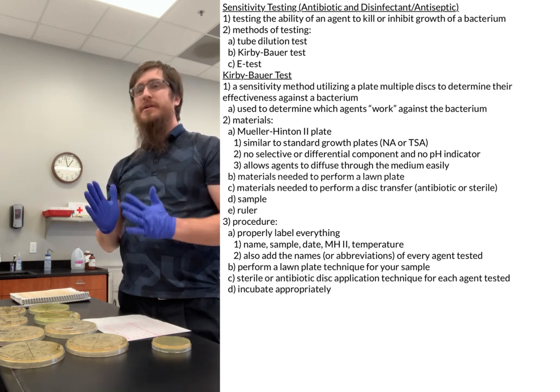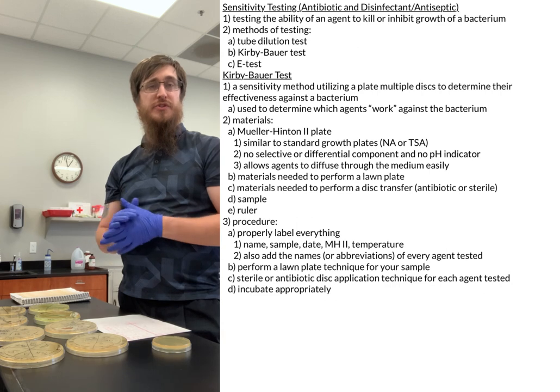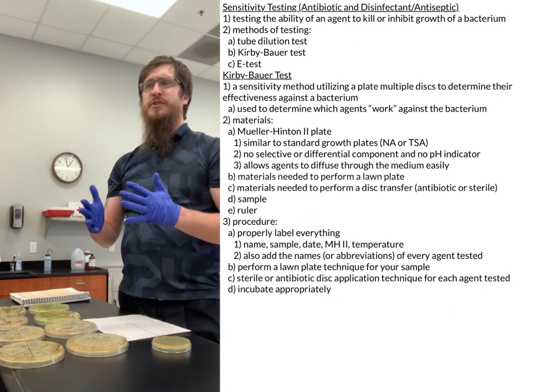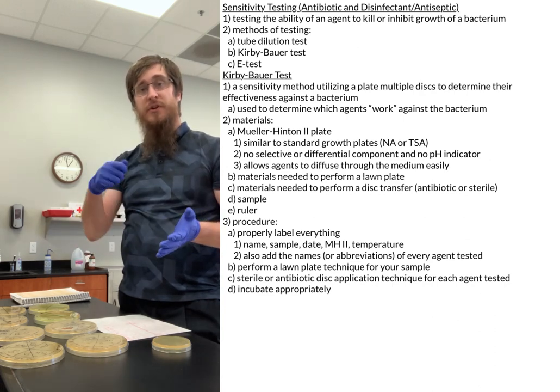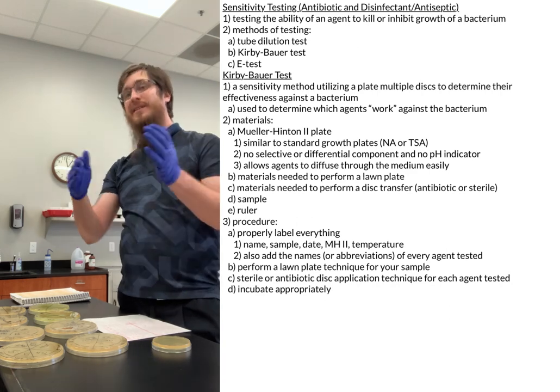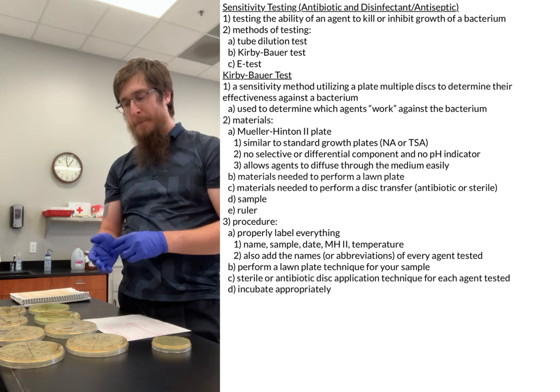A big thing here, you have to do the lawn before you do your sterile disc application. If you do the sterile disc application first, when you go to the lawn technique, you're going to knock all the discs off of the plate. So make sure you do the lawn technique first, then do the disc application technique. If not, you're going to mess up the experiment.